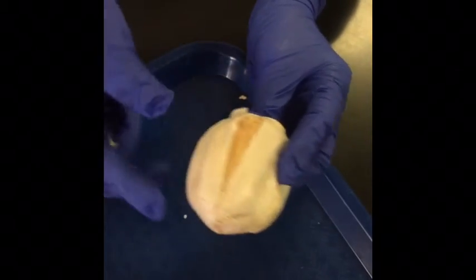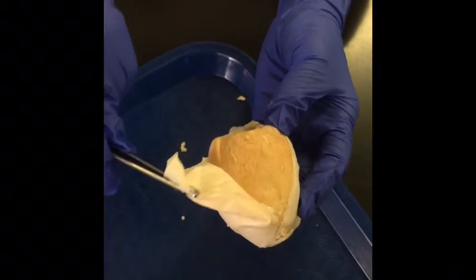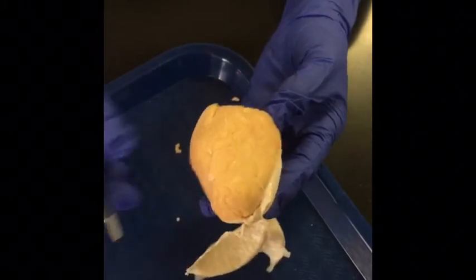The second layer, which is the layer that comes off, is the visceral layer. It covers the spermatic cord, testes, and epididymis as a whole.